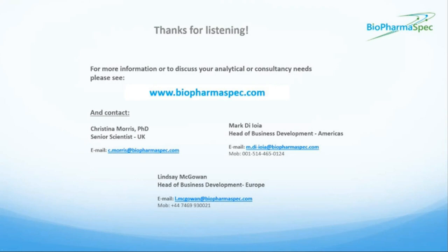Thank you. Our next question, is it possible to quantify all the HCPs in a biological product using MS? All right, so the short answer there is no. We're not going to find necessarily all the proteins, which is why it's recommended as an orthogonal technique. But I would say, just as I've discussed with ELISA, the same is true for that kind of methodology.